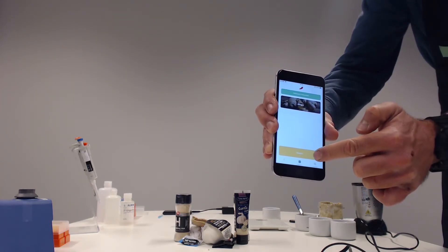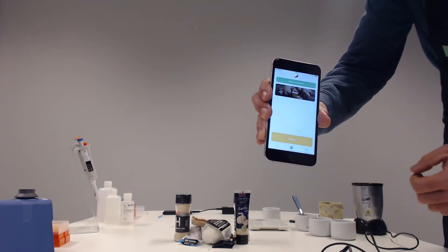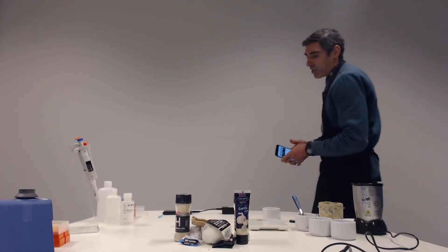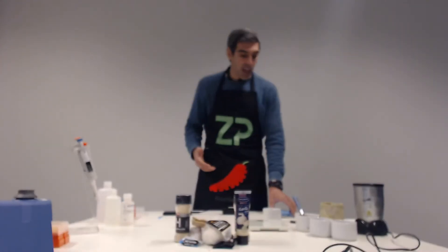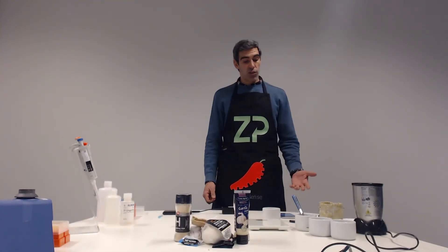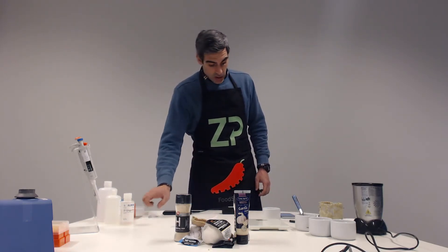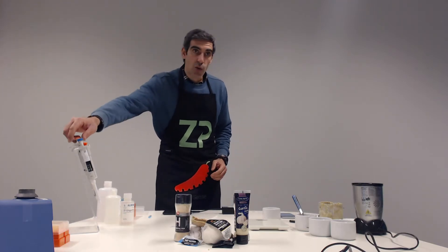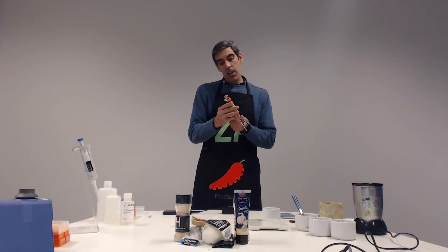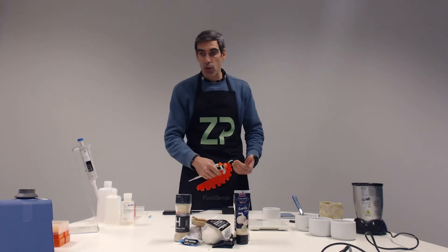Once I have the sample on the sensor, I will have to pipette that sample onto the sensor. I'll press measure and wait for the results to pop. It will run an assay, which basically translates to a CV scan. The peak current of the oxidation peak for gingerol will be an indicator of how much gingerol we have in our sample. So the sensor is in position, everything is ready. I will pipette 40 microliters of the food sample to the electrodes in order to properly cover all the electrodes.